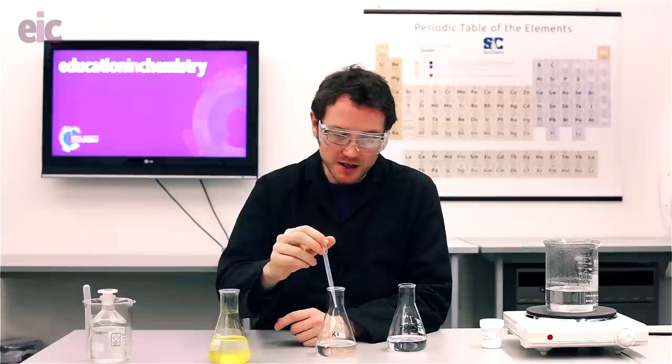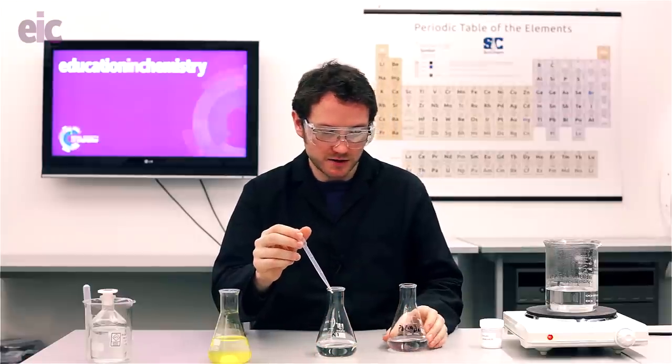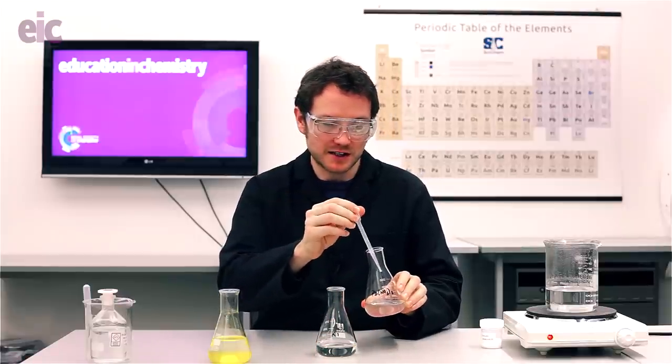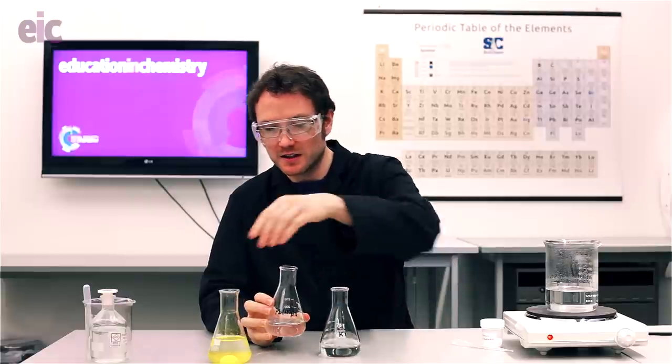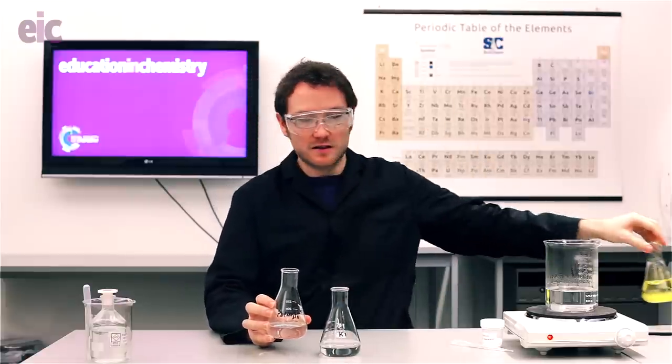For this next bit, it's good to have a point light source or a collimated light source to really catch the shininess of the tiny crystals we're going to be producing. They show up much better in real life than they do on camera, but I'm going to try my best to capture an essence of what's going on. What you're going to do is take the remainder of the lead nitrate solution and pour it in quite quickly into the potassium iodide solution.